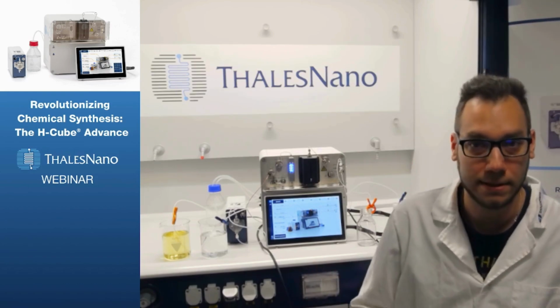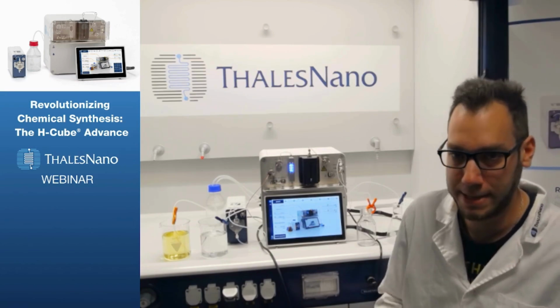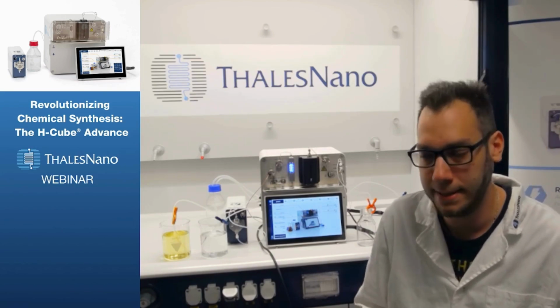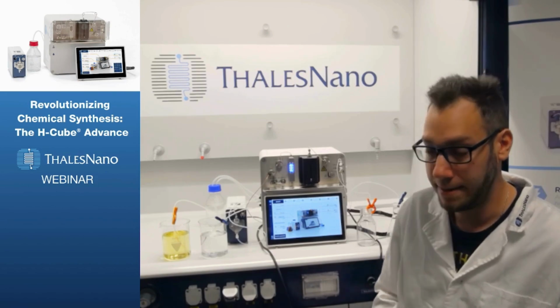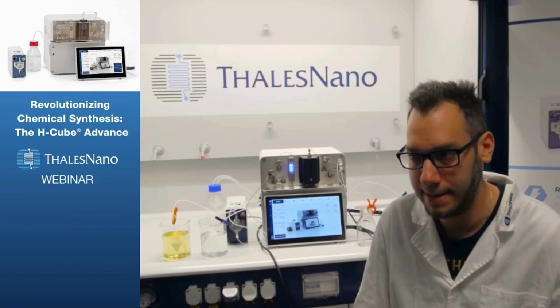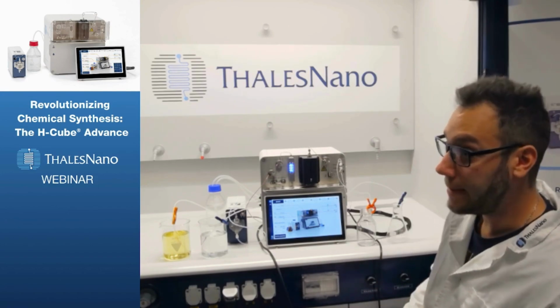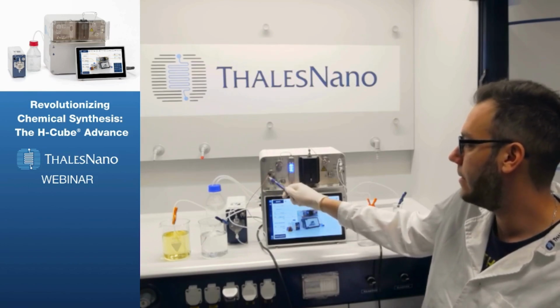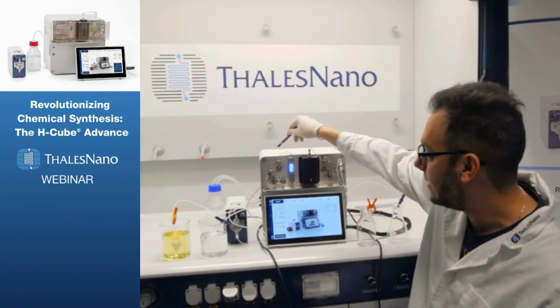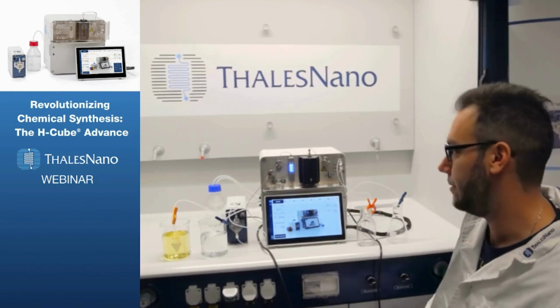Today we are using the instrument with the internal gas already selected and the pressure already built up inside the system. So you get an immediate option available to you to start injection of the hydrogen gas as well. And if you do that, the mixing of the liquid that's coming from this tube and the gas that's coming from internally happens at this point. So this is a gas liquid mixer.